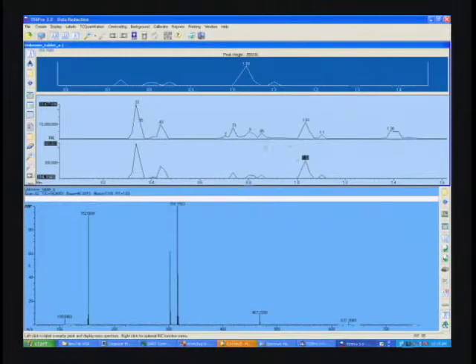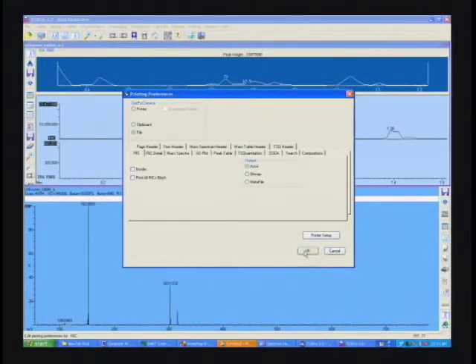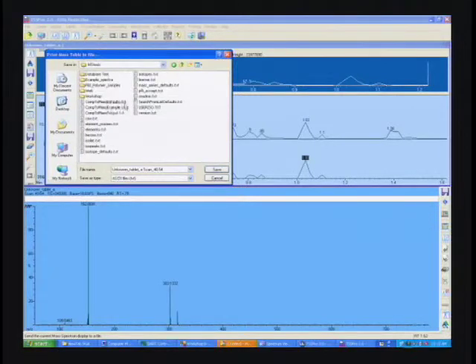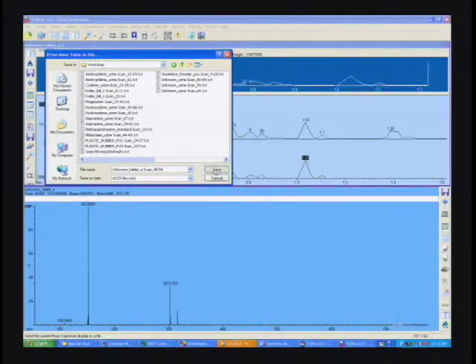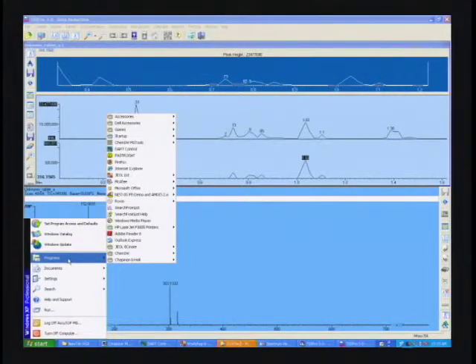For example, we take a look at this average mass spectrum. We measured the tablet 3 times. Here's an average mass spectrum for the tablet. We see 3 different peaks in here. These have all been properly calibrated, so what we're going to do is save this to a file. I've got this set to save to a clipboard right now, so let's save it to a file instead. And so we'll save the mass spectrum in a folder where we can find it later. Let's just save this in the workshop folder. Now we'll open up a program that lets us figure out what these peaks mean.